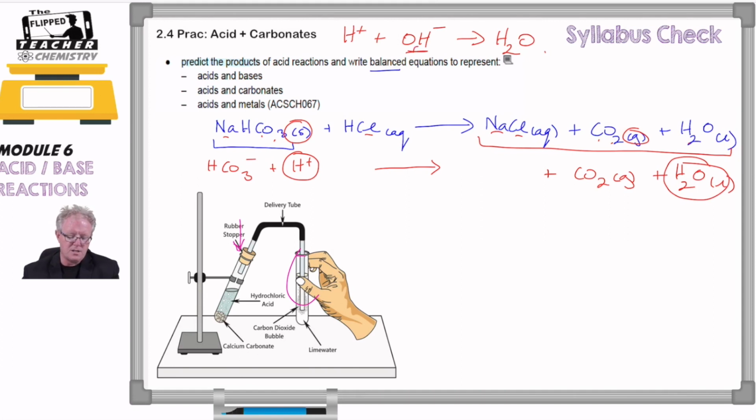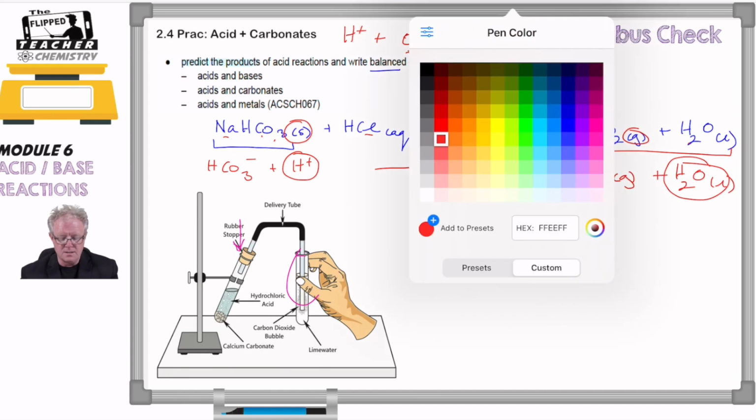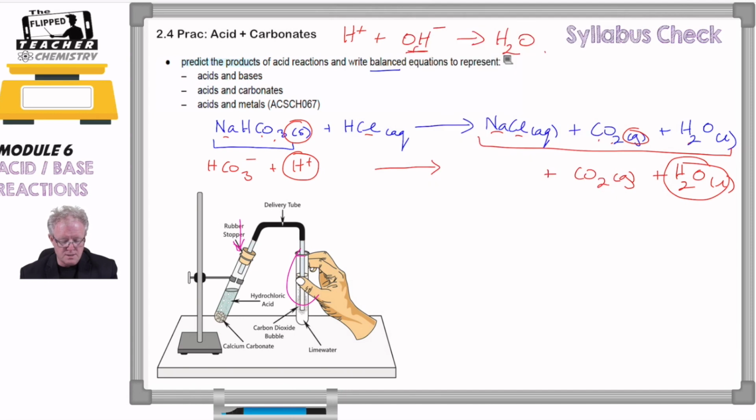What's sort of going on there? Well, that OH is coming from another reaction that's occurring at the same time here with water. We're going to explore that concept a little bit later on when we delve deeper into this acid-base topic. So that's hydrogen carbonate. And then we have sodium carbonate.